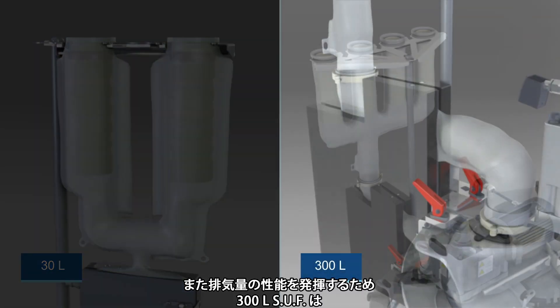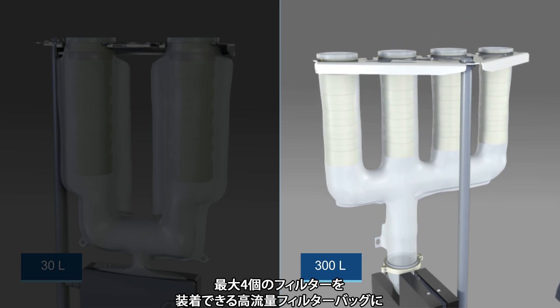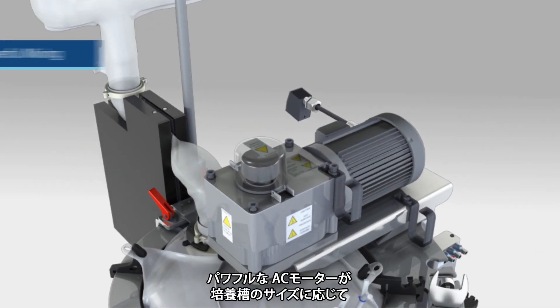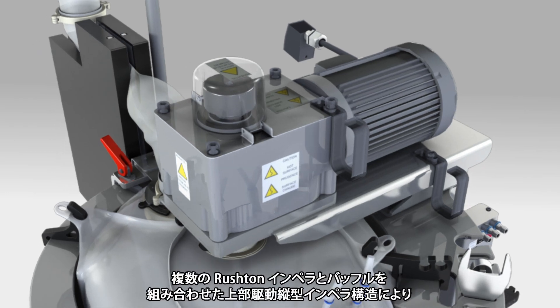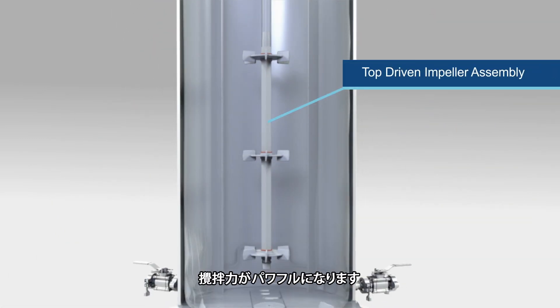The 300-liter SUF accomplishes this by using a 3-inch exhaust port attached to a high-flow filter bag that can be configured with up to 4 filters. The powerful AC motor supports mixing rates ranging from 35 to 600 RPM depending on the size of the fermenter vessel.